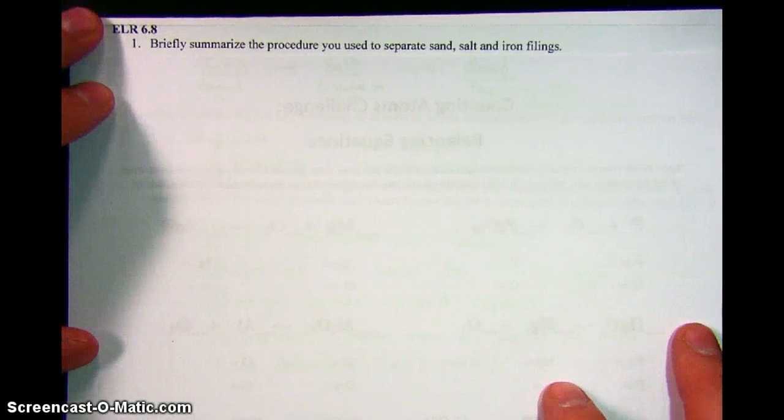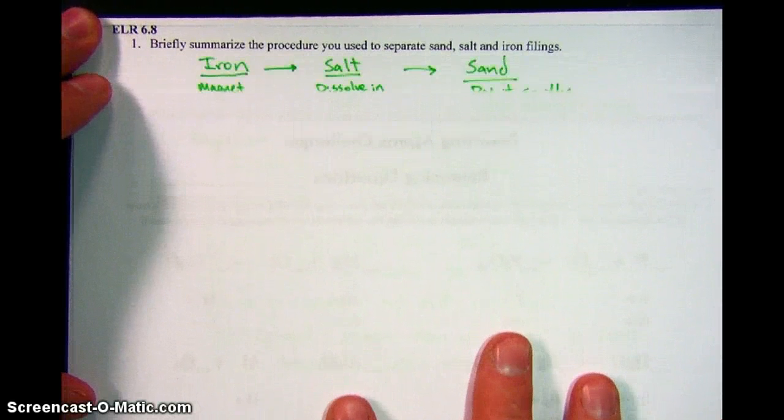This is the Unit 6 study guide video for ELR 6.8. This entire ELR is based on the lab that we did in class where we separated the mixture of iron, sand, and salt. The first question is asking you to briefly summarize your procedure, and I drew this diagram.